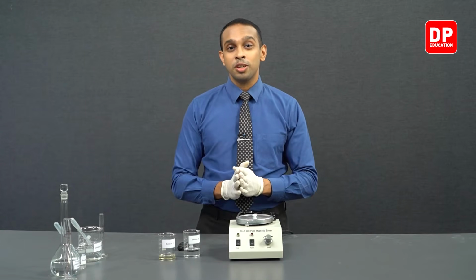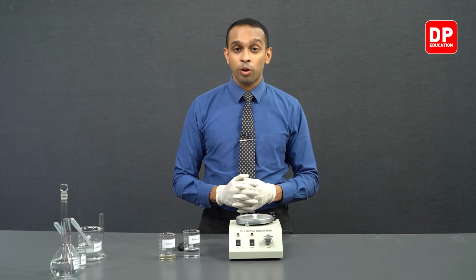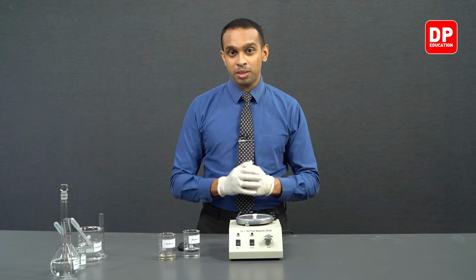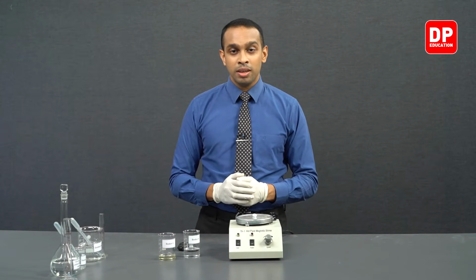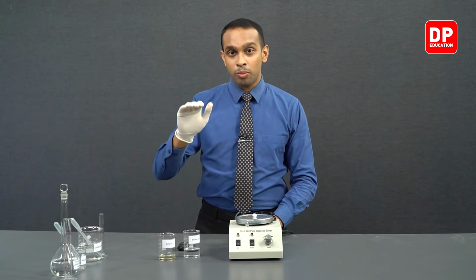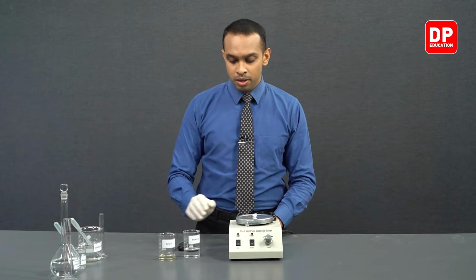So keep in mind students, throughout these 5 reactions, you will observe that the overall volume of the reaction mixture is going to be kept at 50 cubic centimeters. And that is why we are going to be adding varying volumes of water. As we decrease the volume of Fe3 plus we take into the medium, the volume of water that we take into the medium will be increased.